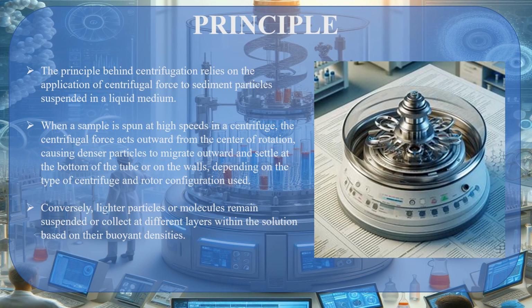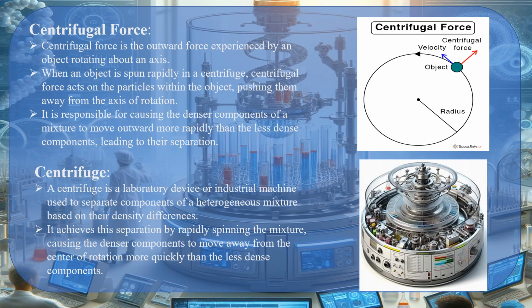The principle behind centrifugation relies on the application of centrifugal force to sediment particles suspended in a liquid medium. When a sample is spun at high speed in a centrifuge, the centrifugal force acts outward from the center of rotation, causing denser particles to migrate outward and settle at the bottom of the tube or the walls, depending on the type of tube, centrifuge, and rotor configuration. Conversely, lighter particles or molecules remain suspended or are confined to different layers within the solution based on their buoyant density.